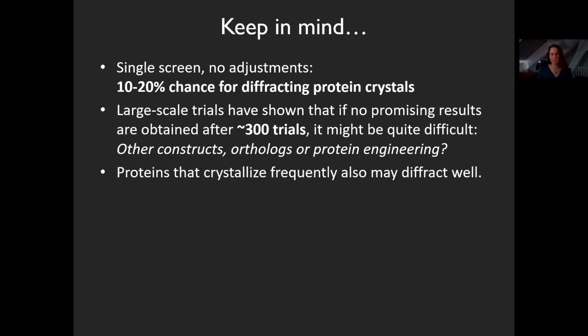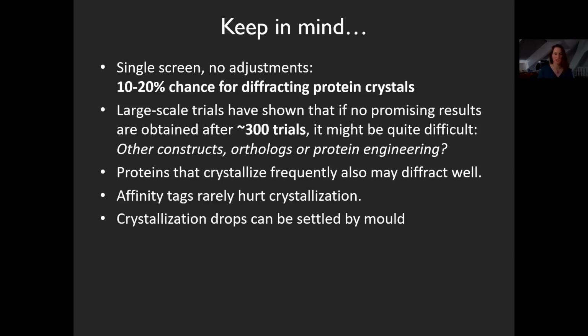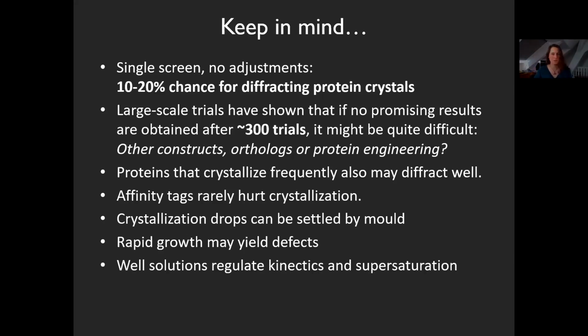Proteins that crystallize in many different conditions may also diffract well. Affinity tags rarely hurt crystallization. Crystallization drops can be settled by mold, we already had that. Rapid growth may yield defects, so you want slow growth, not too slow. I mean, your PhD thesis has to end eventually, but if the stuff grows in 2 hours, the crystals won't diffract very well in most cases, unless it's lysozyme.